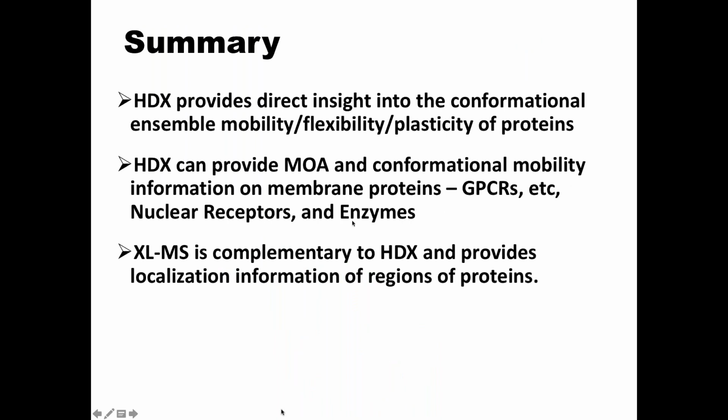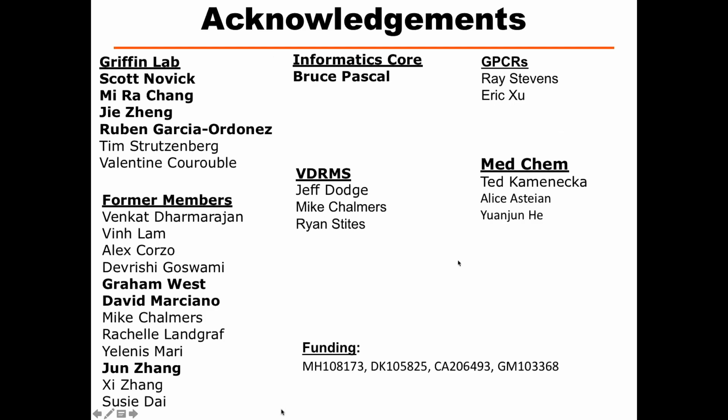And for the summary, and also for the HDX section, deuterium exchange can provide direct insights into the conformational ensemble, mobility, and flexibility of the protein, and it's good for protein enzyme activation studies for any enzymes, and it's complementary to cryo-EM and also crystallography. Here's the last slide.